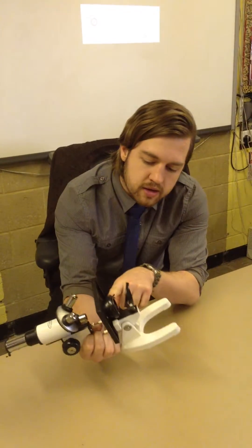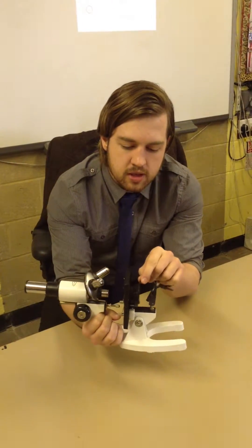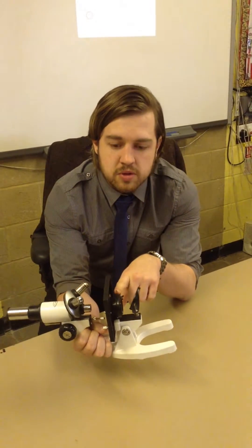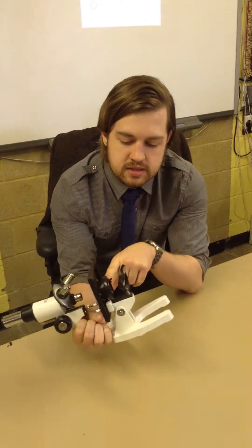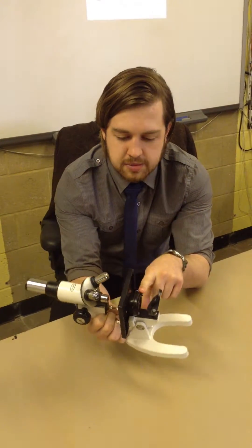After the mirror, the next part is your aperture. Now, the aperture hole can be altered by moving the different parts around. Every time you use the microscope, you want to make sure that this is set to the biggest hole possible. So, mirror, aperture hole.